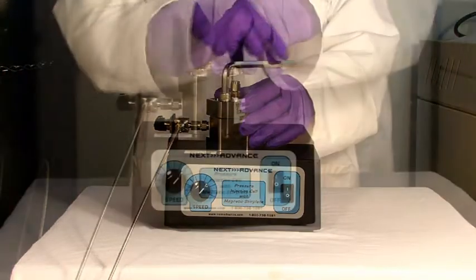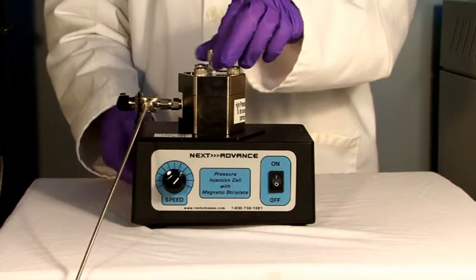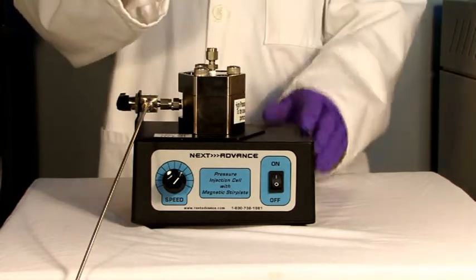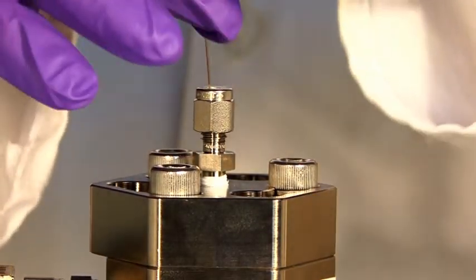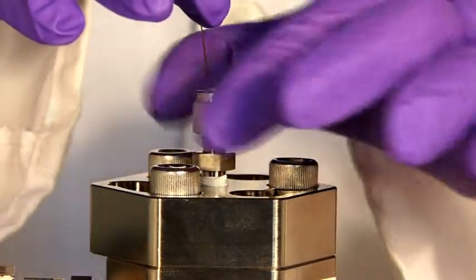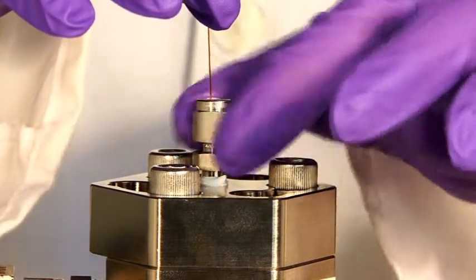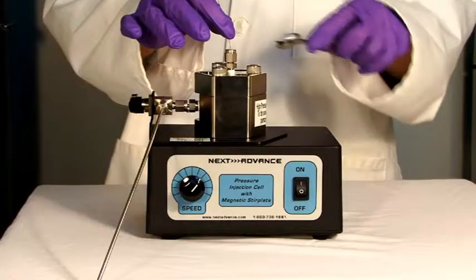To insert the capillary, loosen the nut covering the ferrule using a wrench. Slide the capillary through the small hole in the ferrule until it reaches the bottom of the sample tube. Pull up slightly to avoid blocking the capillary. Once the capillary is in place, tighten the nut.